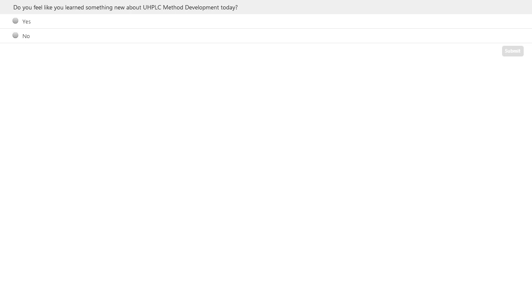Someone asks, when converting your gradient time, how do you account for hold times within the gradient? Do you treat the gradient on either side of the hold time as its own gradient time? So if it's a multi-step gradient, maybe I'd consider it that way. You need to translate each step of the gradient, and that can be whether it's a slope or an isocratic part.